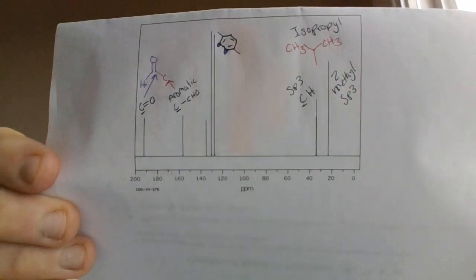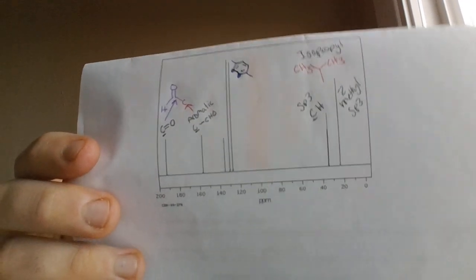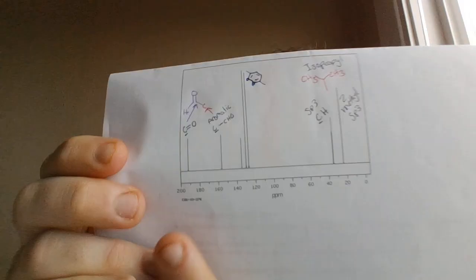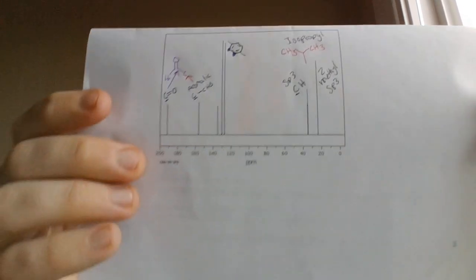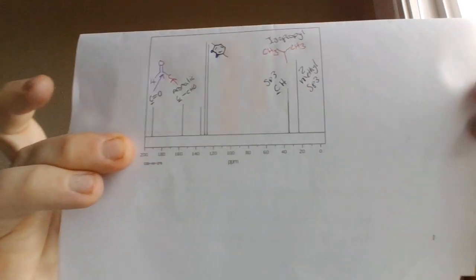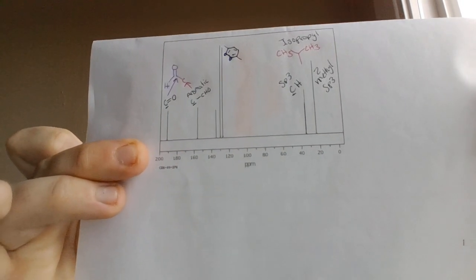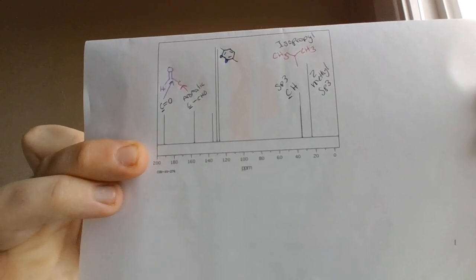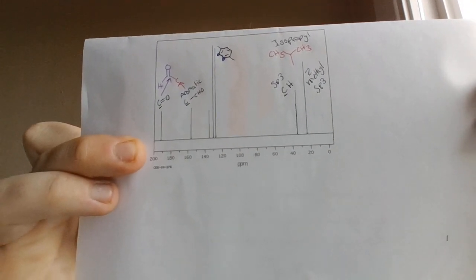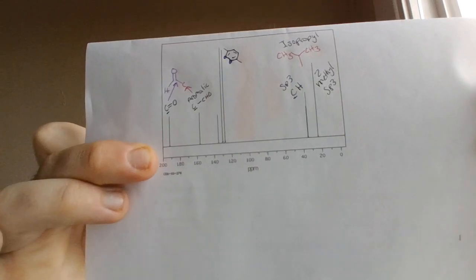After that, we have the carbon-13 spectra, where we also have three distinct functional groups, but more spikes that go along with that. Starting all the way down at 200, right below 200 is the aldehyde functional group that comes off of either benzene carbon 1 or carbon 4 on the benzene ring.